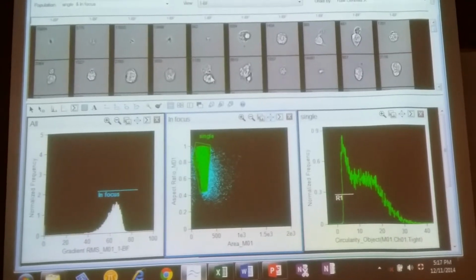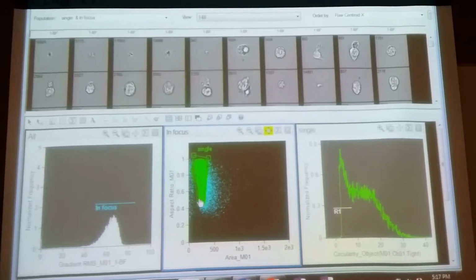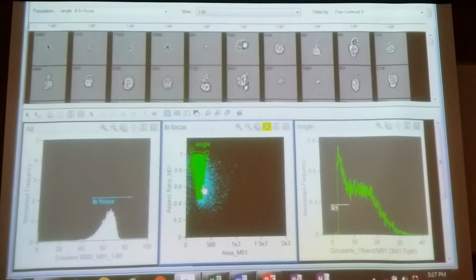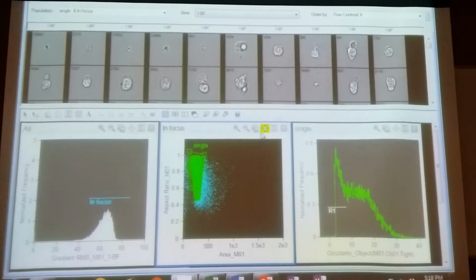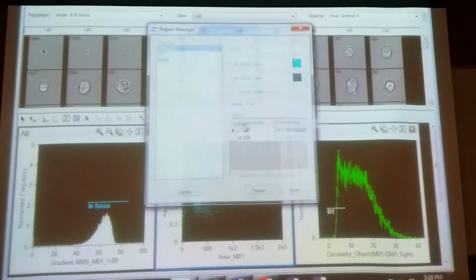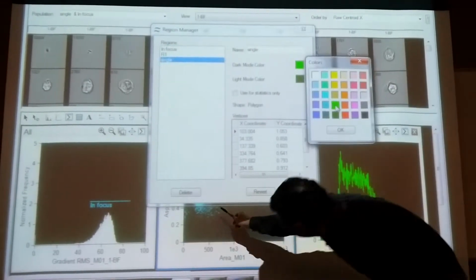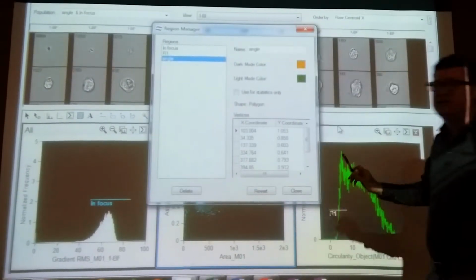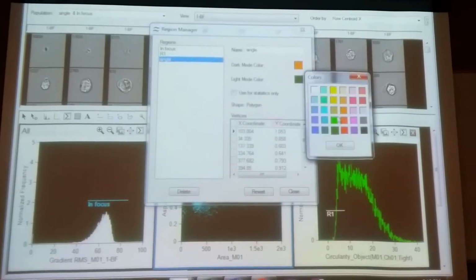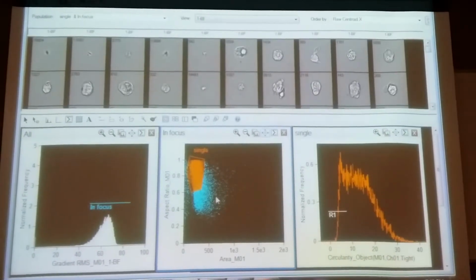See, this cell is clearly a doublet, right? And it's right in there. So maybe what we need to do is adjust this up. How did you show where it was? You clicked on it and then the crosshairs showed up. It's hard to see. I had the same problem trying to do some analysis. I didn't see the crosshair, but it's there.